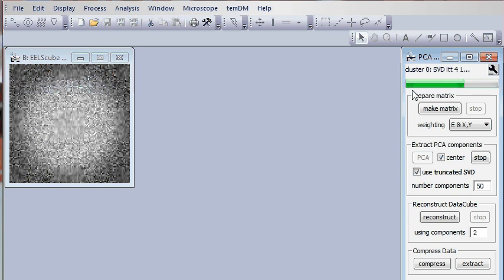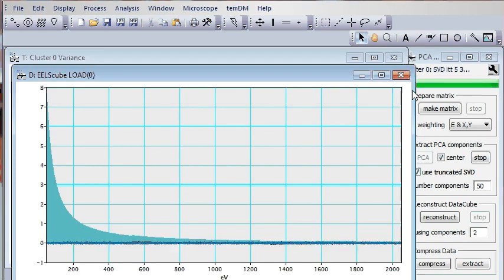Well, it's still not a compiled procedure, but it uses a clever algorithm which is based on the compiled elementary operations incorporated into Digital Micrograph. Thus, it's reasonably fast. If you compare that with the few available compiled programs for PCA, I think my package would be quite competitive.